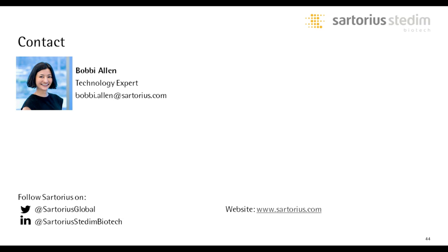The first question is, what kind of tank interface options are available? The tank interface options. So depending on the vendor, you will see that there are a wide variety of options. They range from 3/4 inch TC.